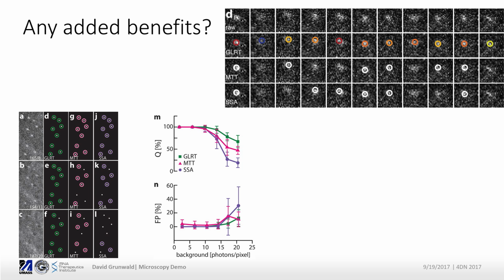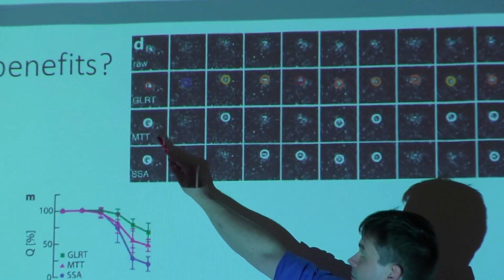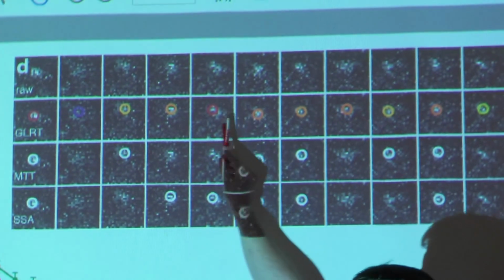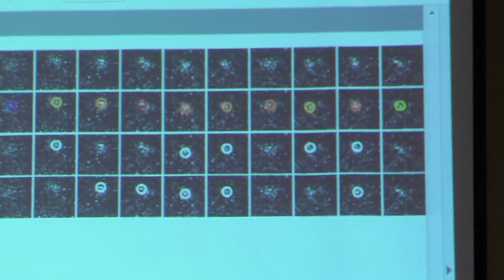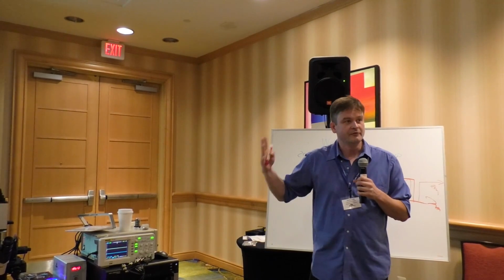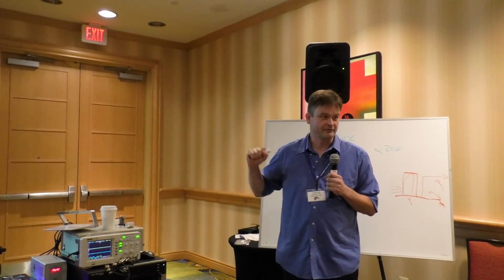Well, tracking, live cell, right? Here's something that's called a multiple target tracking approach. You say yes, no. Here's an approach where you say probabilities, and you just say, oh, this is rather unlikely, but these two are pretty okay. And you can start inferring information from there in a quantitative way, where you say, oh yeah, I have a movement of a particle that I see with around 75% probability the frame before and 90% the frame after, therefore I infer. Or you go to the military and take some of their technology for these sorts of decision making.